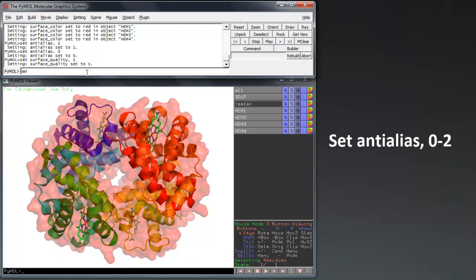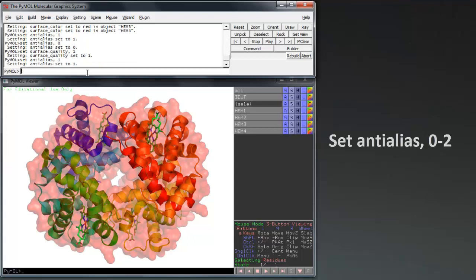The final step before rendering our image is to activate anti-aliasing using set anti-alias 0 to 2 to make sure that there aren't any jagged edges in our final image.